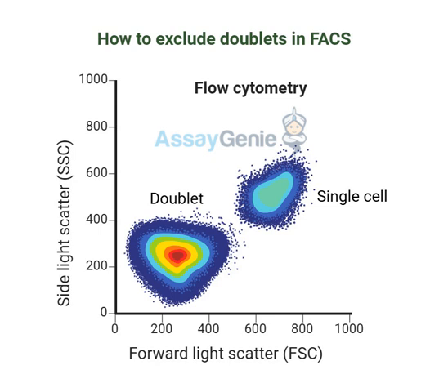That's a scary thought. It is, isn't it? And you know, the opposite could happen too. If a drug isn't actually working well, those doublets could make it look more effective than it really is. So it's a double-edged sword. Exactly. And that could give patients false hope, or even worse, lead to harmful side effects.